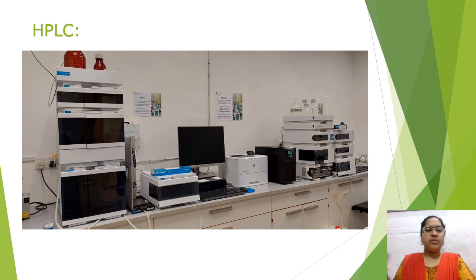And this is the original diagram of HPLC chromatography, which has solvent, pump, injector and HPLC column, system for monitoring the graph and a recorder or printer.